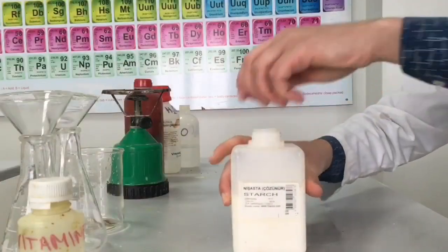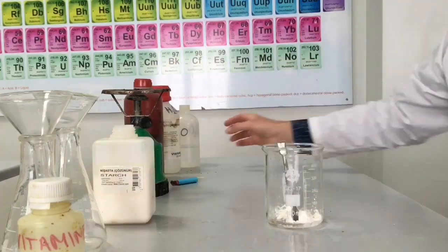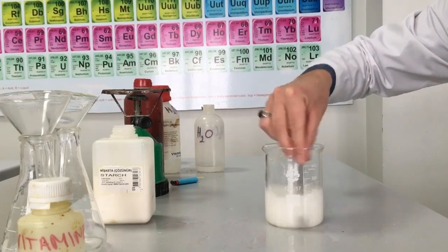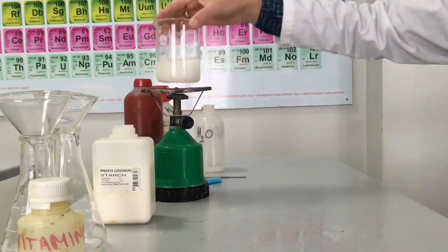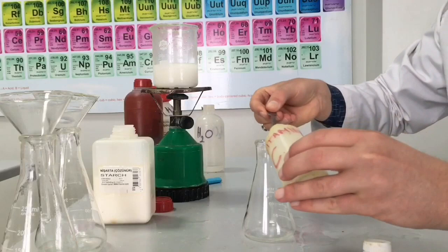We are presenting you the iodine clock reaction. First, we prepare starch solution. Now we are preparing vitamin C solution.